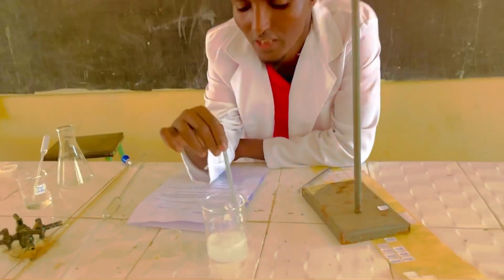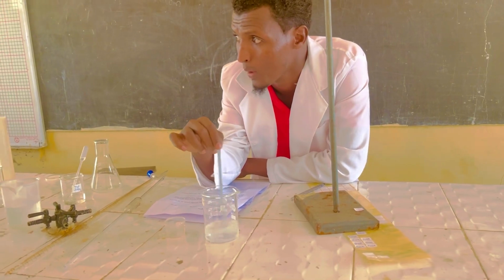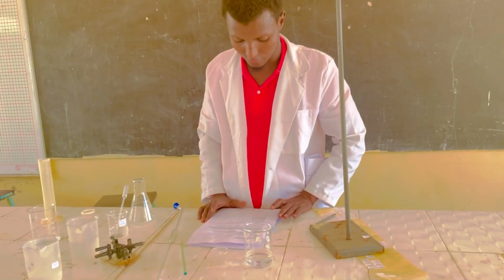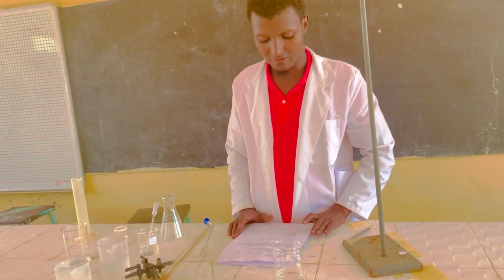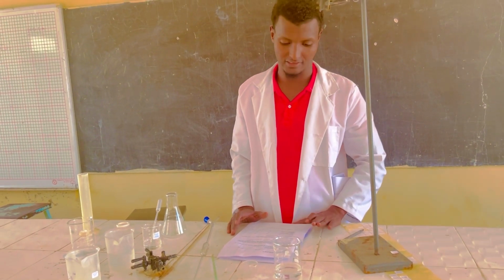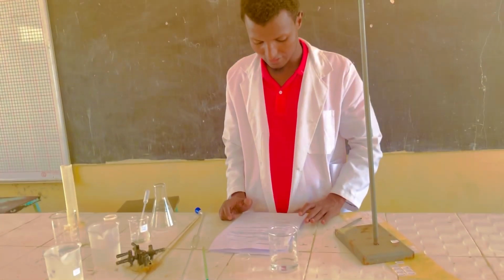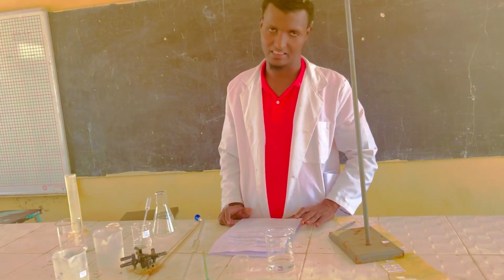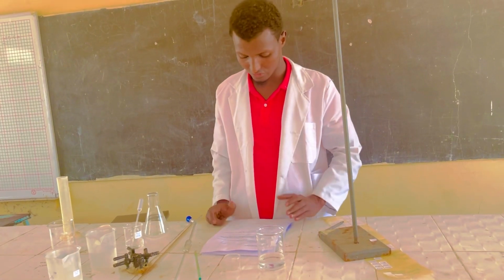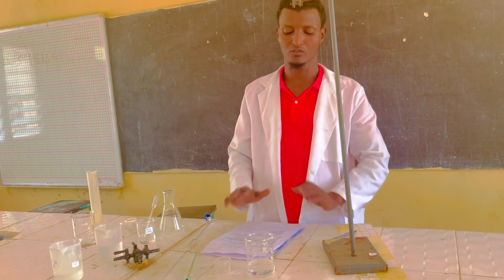So we are allowing the reaction to take place. The next procedure is to leave the mixture for 3 minutes until there is no effervescence. I left that one for 3 minutes.